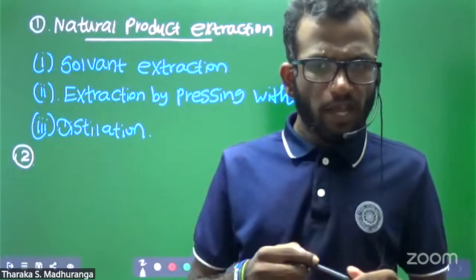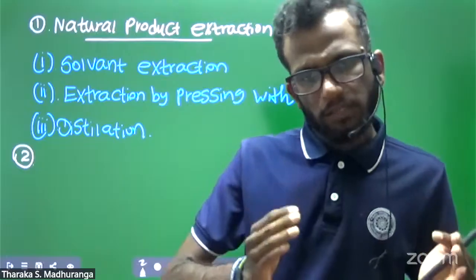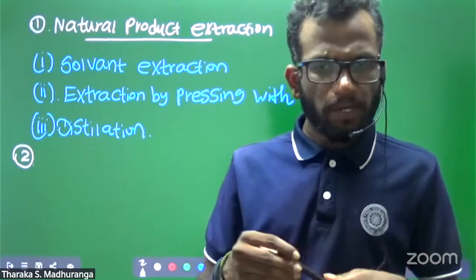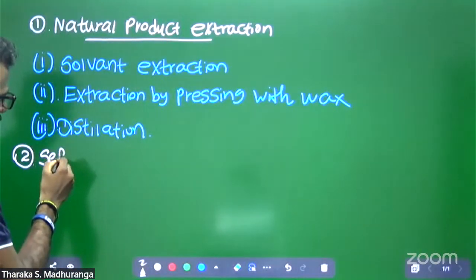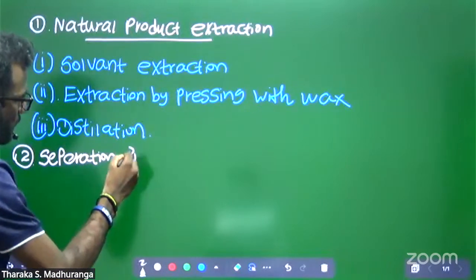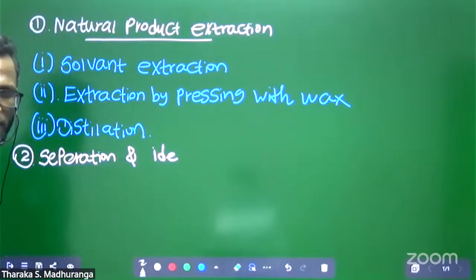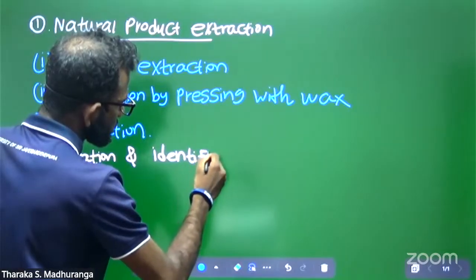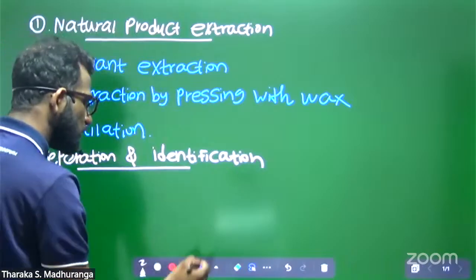The extraction methods are what we discussed in this lesson. Then the separation and identification process. I gave that, yes? Separation and identification methods.